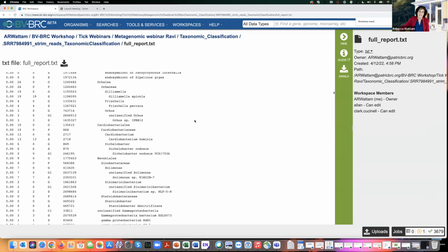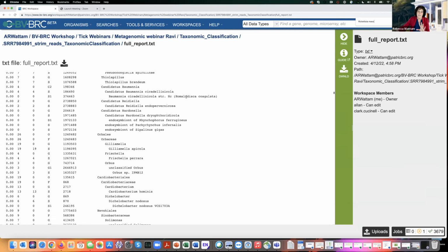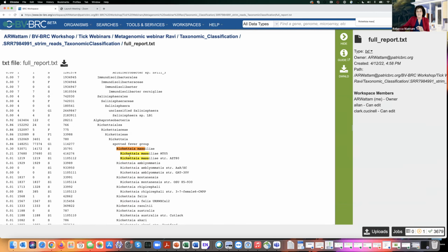So this is the end of the taxonomic classification stuff. But what I did originally, and the reason I bring this up, is it gives me things I can align my reads to, to try to game the system and be able to get better results.